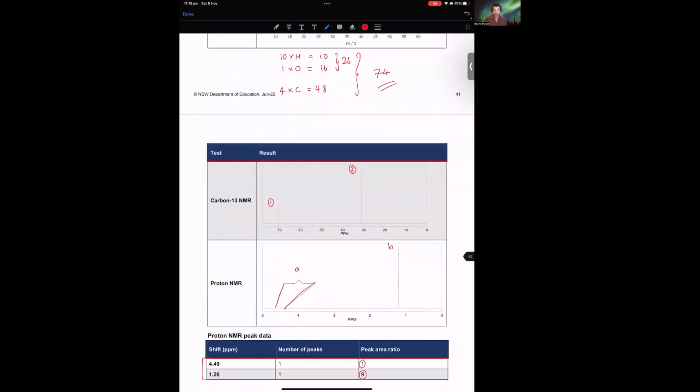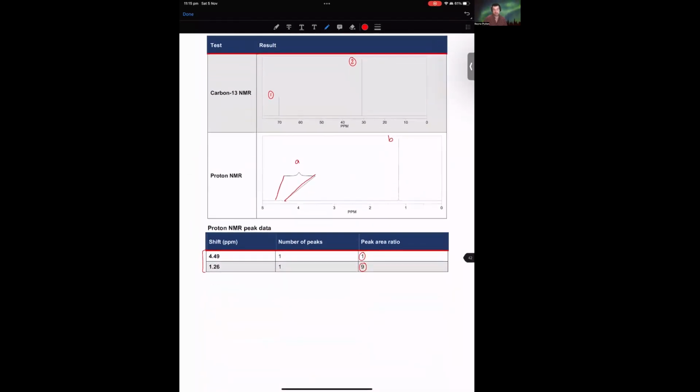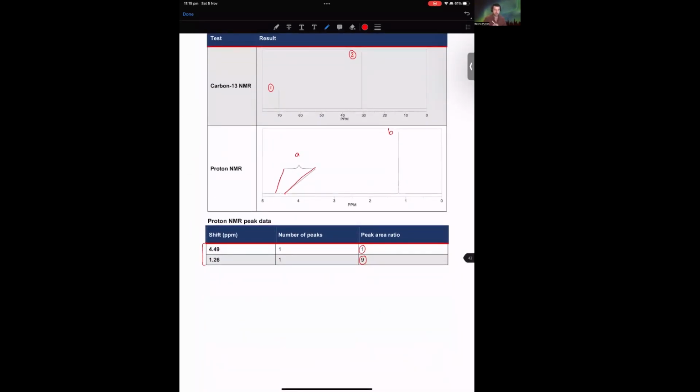We know that there's an alcohol present. So we come back to that idea with the type of proton peaks that we see, these singlets, and the fact that there are 9 protons for peak B. And that to me suggests that we have this kind of structure where we have 3 terminal CH3s and they're all equivalent to one another.